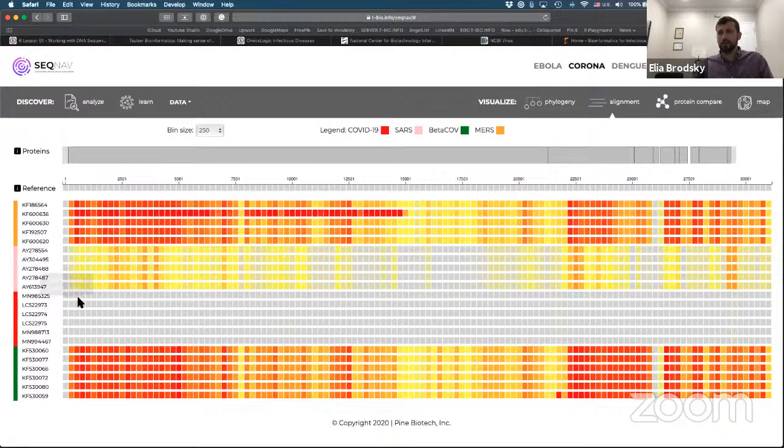Okay, so again, gray means it's identical. So you can see this is 0 changes from the reference genome. So here we see all of these are gray, probably leads us to think that the reference that we're using here is a beta coronavirus or the SARS-CoV-2 genome.